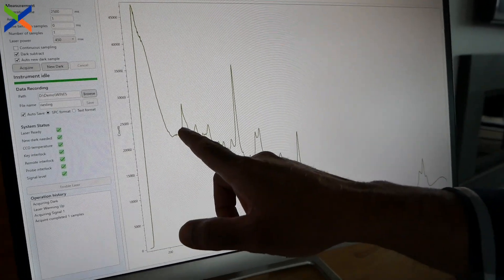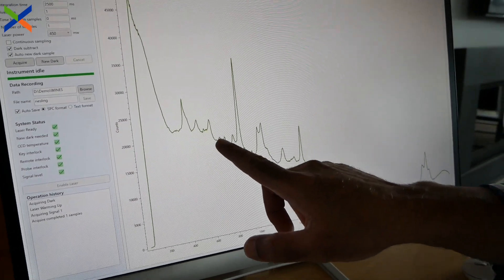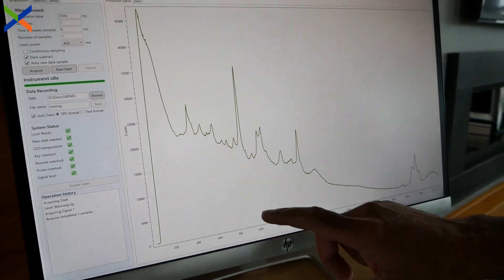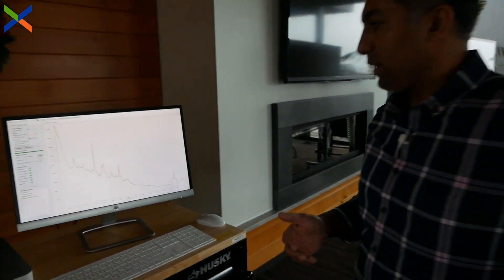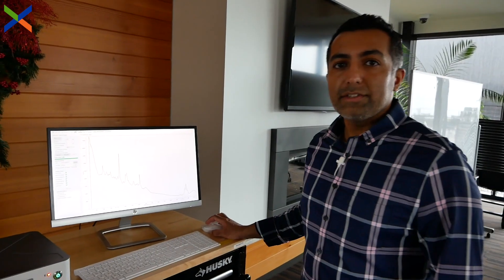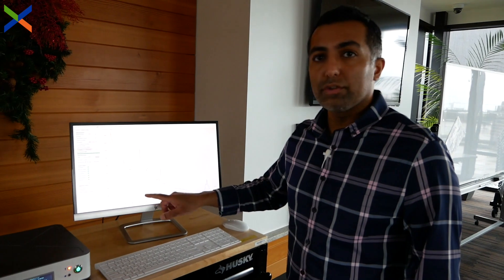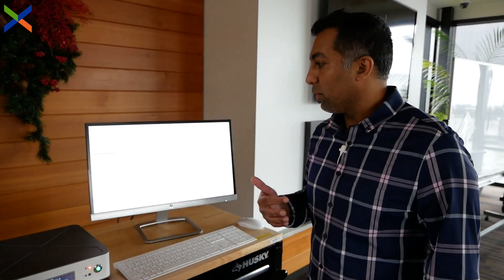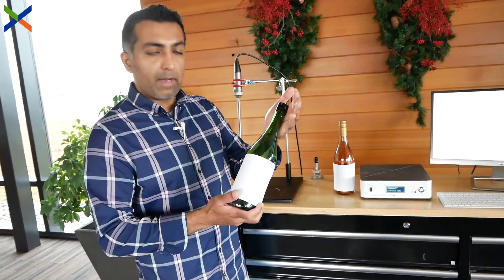Some of the peaks you're seeing in the background — the smaller ones — specifically belong to the sugars in this wine. It would be interesting to see the ratios of the alcohol to the sugar peaks in the different wines that we're going to measure, which would give you an idea of how sweet or how dry some of these wines are. Next, we're going to measure the Raman spectrum of sake.